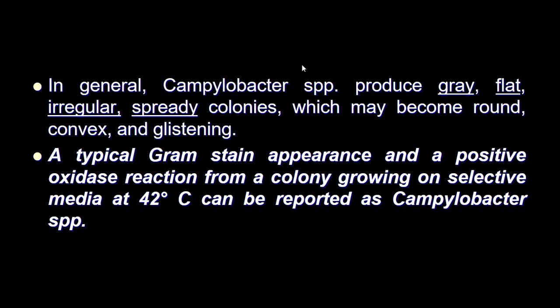So it's extremely important to do the oxidase testing for those to differentiate them from members of the Enterobacteriaceae, and growth at 42 degrees centigrade, and comma-shaped cells like Campylobacter. So it is very important to do these types of testing in the identification of those pathogens. Growth at 42 degrees centigrade, oxidase reaction, and Gram stain are very, very important in their identification.